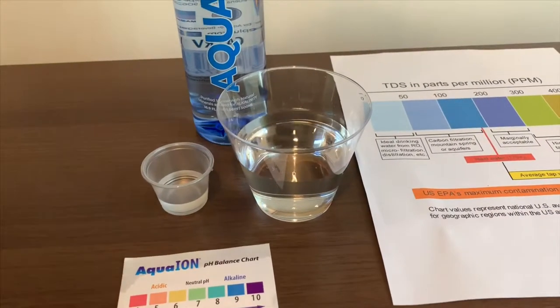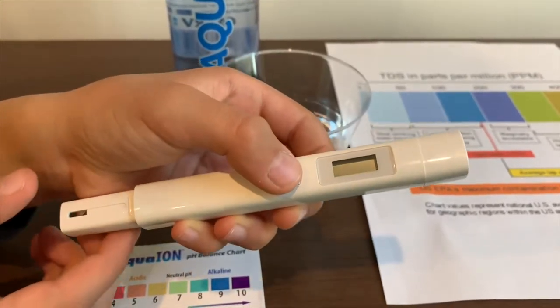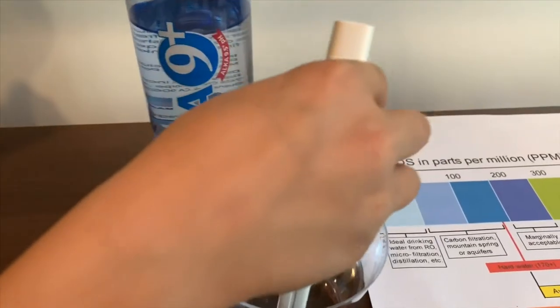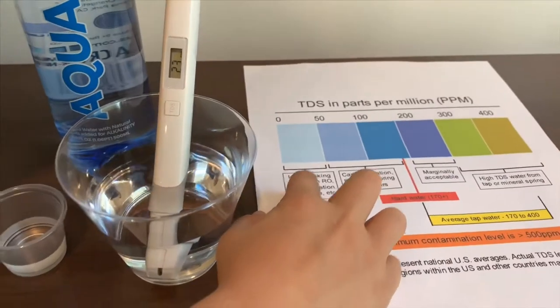First we're going to test the TDS level. If you want to buy this TDS tester, check the link down below. Turn on the TDS tester, make sure it says 0, and let's put it in. 25 — that is ideal drinking water.